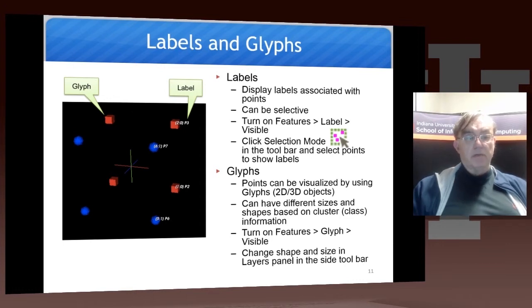But you can turn the glyphs on or off. And typically, you keep them off initially, because you can take the point size and increase the point size, and that at least makes them more visible.